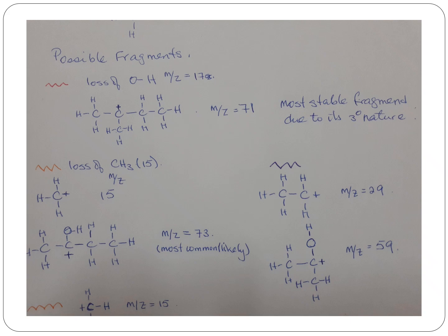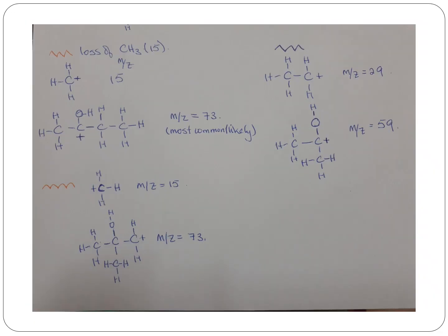They've asked me for my fragment at 59. And this is going to be my answer here, whereby that molecule has broken down the middle, and my fragment at 59 has my 2 methyl groups, a carbon, and my hydroxyl group attached. They haven't asked me for my 29, but because we can put the 2 pieces together, I know that these 2 things will connect.